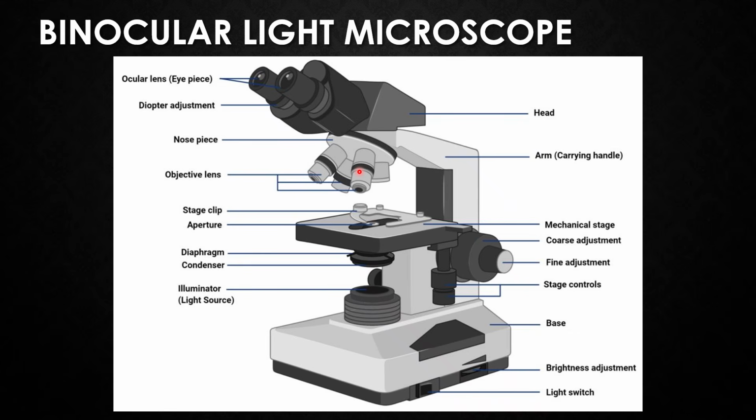With no layer of air, more light from the specimen enters the objective lens instead of being refracted outside of it, and this results in a sharper image, and the image will appear very clearly and as a fine image.